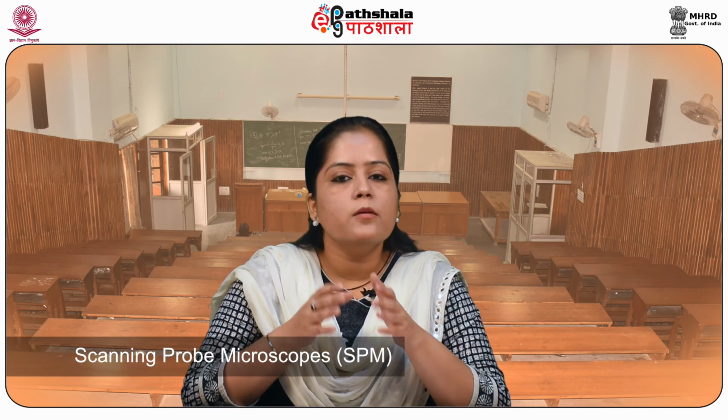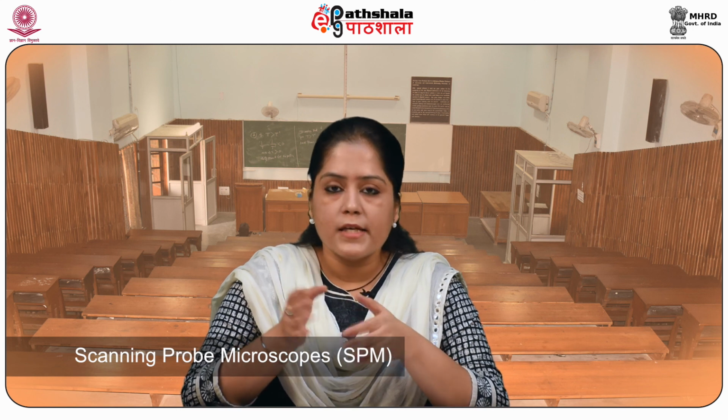In situ, localized, non-destructive measurements or modifications are possible with STM. It is used in material science, physics, semiconductor science, metallurgy, electrochemistry, and molecular biology. Scanning probe microscopes, SPM, are designed based on the scanning technology of STM.